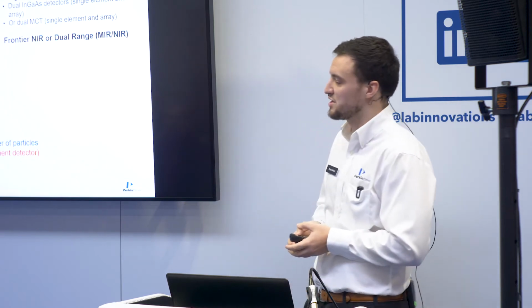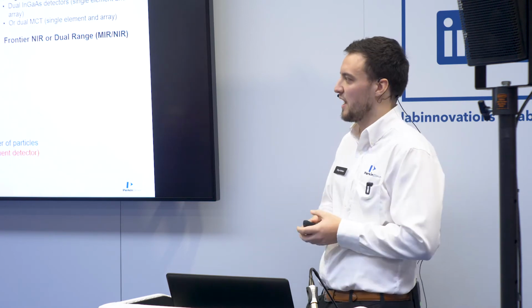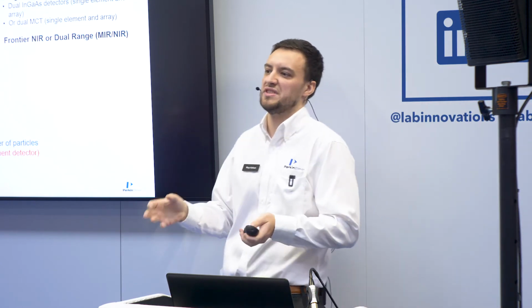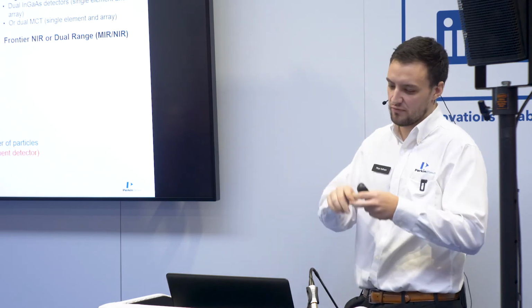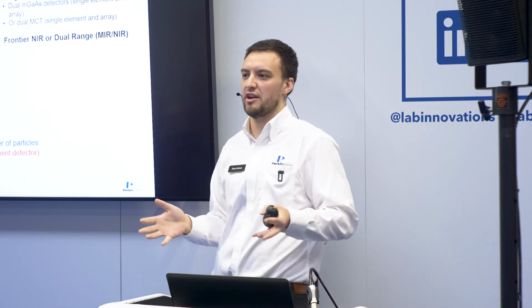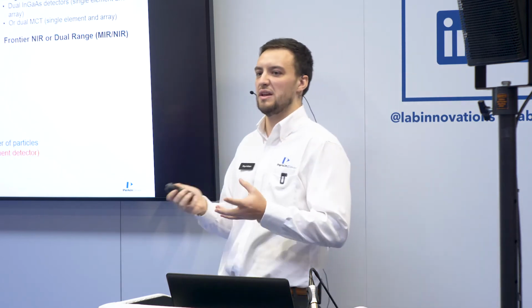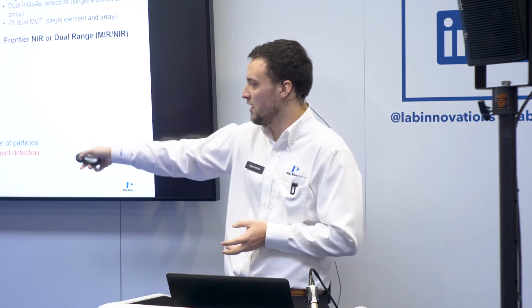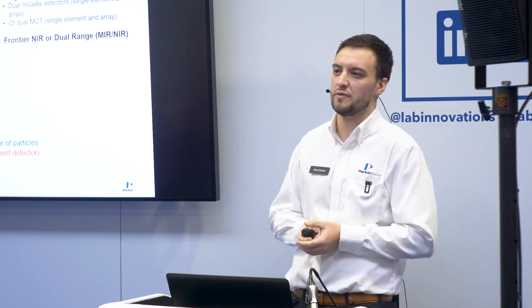And then we have multiple measurement modes in how we go about that analysis. So point mode is really good. It's just what we say is like point and shoot. It's really good for identifying small areas within a material and what those areas are. We can also do mapping, which is, again, good for gaining information over an area. But when it comes to a large area like a whole tablet, the mapping uses our single element detector, so it actually becomes too slow. So that's where we move to our linear array, which is unique to PerkinElmer, and we do our imaging data, which is really good for large areas.